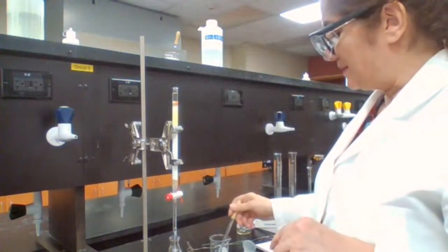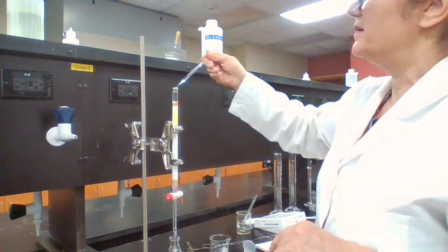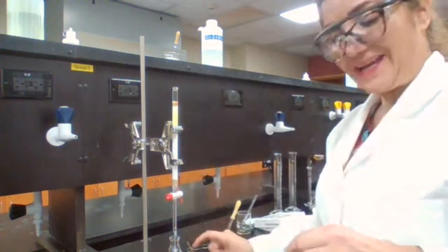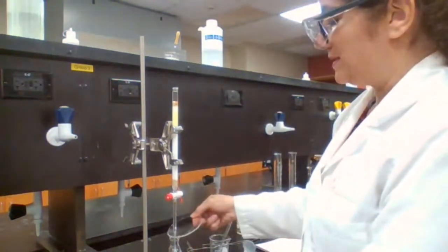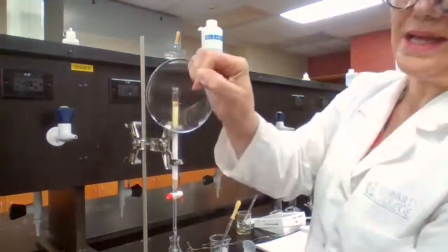And when I see no white residue, that means all of the fluorene has been removed, or collected, rather. So I'm going to test it again. Still, I have white residue.